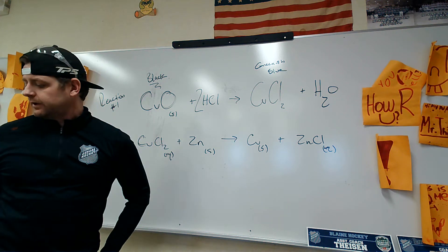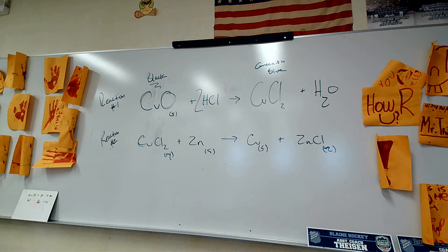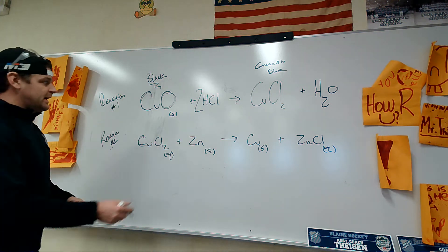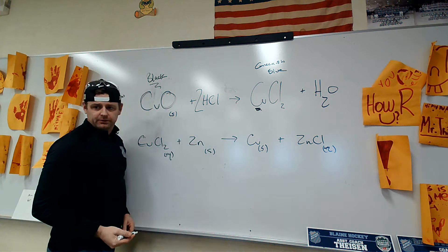Now we're on to reaction number two. We made copper oxide to copper chloride, and we got that greenish blue solution.